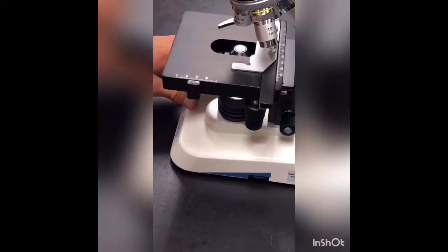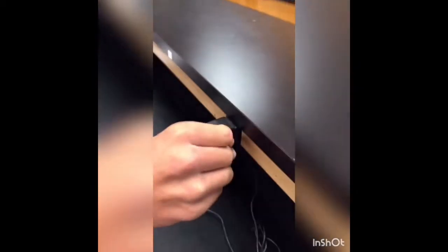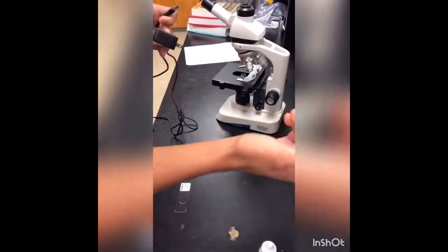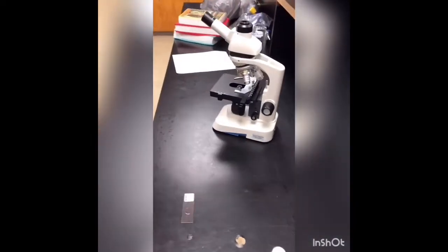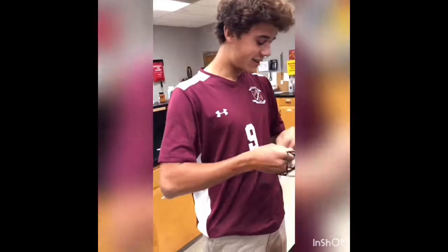And then you turn the microscope off and you unplug the microscope, and then you unplug it from the socket. And you want to make sure you do unplug the microscope first before you unplug it from the socket. And then you want to wind up the wire in an orderly fashion and set that aside.